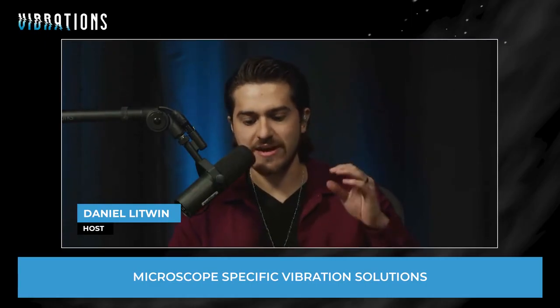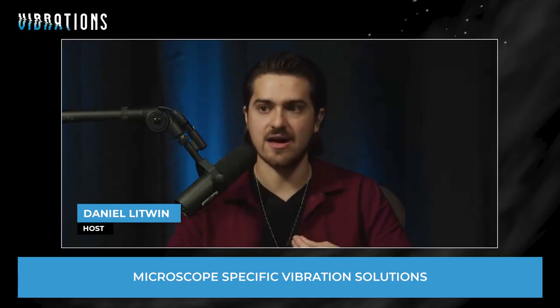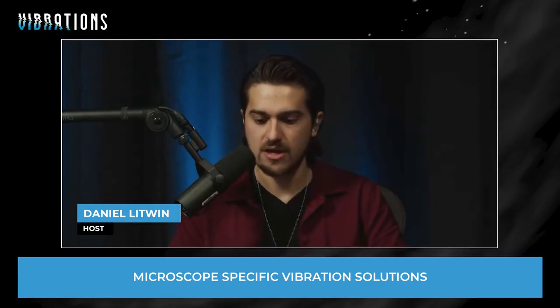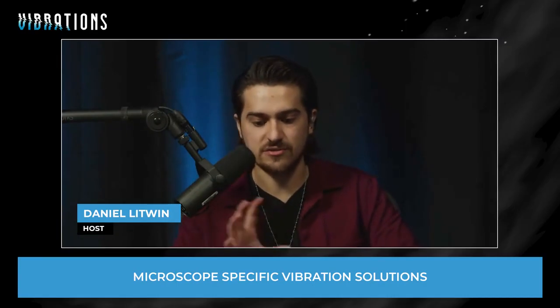We're also going to be chatting about assessing and mitigating vibration issues, right? So hopefully when you walk away from this podcast, you'll better learn how to identify or have the right framework for identifying if vibrations or other factors are impacting your work, right? The role that VC curves, for example, play in site selection, and then arm you with the strategies for addressing some of those external interference issues like construction or raised floors, etc.